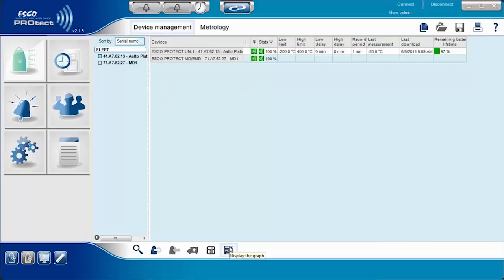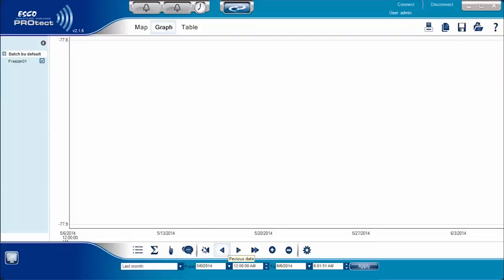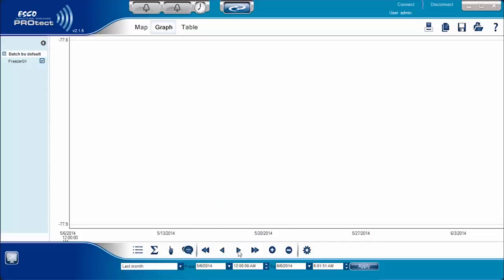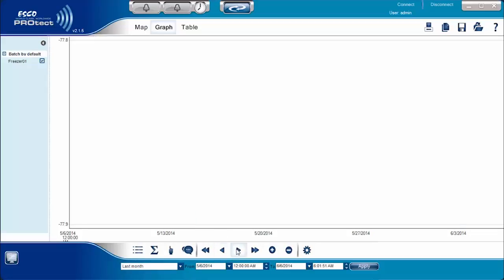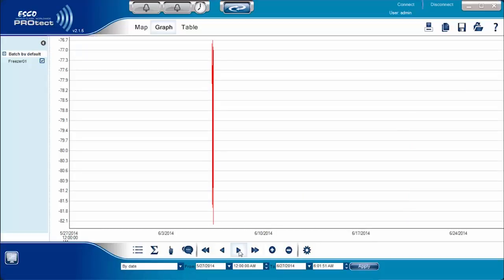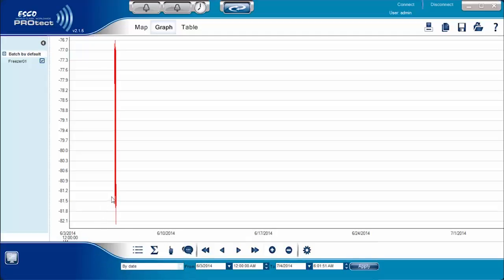We then move on to the use of graphs. It's important that the curves are only displayed until the date and hour of the last data uploaded. However, you can still refresh by clicking on the Upload Measurement icon. This action should only be performed when needed, because if it's performed too often, the battery lifetime will be reduced. The period can be displayed using different options such as by date, the last day, last week, last month, or last event.